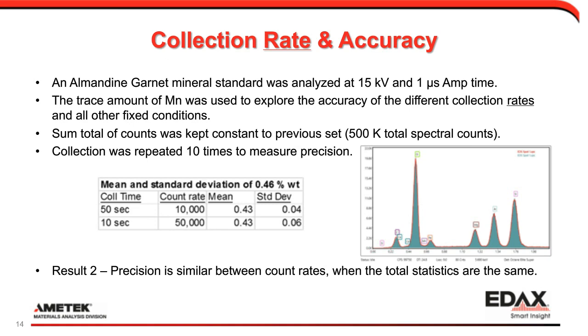But another way of looking at it is that each spectrum itself is actually a number of sampling points. That's because we take a whole spectrum, or a spectrum energy range of counts, and those counts are collected in intervals. So as Jens explained earlier, the concentration formula takes net intensity, and that value is in terms of counts per second. So there are intervals. The longer that you collect for, the larger number of intervals that you have to work with. So even just one spectrum in and of itself gives us the ability to report precision results, because we have many sampling points within that spectrum when we consider it in terms of CPS and integrated intervals.